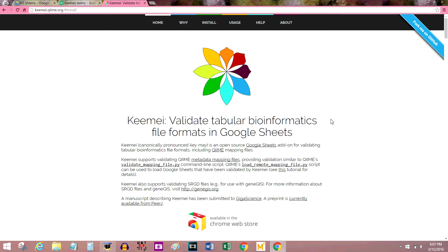Hey there, my name is Riley and today I'm going to show you how to install a piece of software called Keemei. Basically it's a bioinformatics file validation software that's a plug-in for Google Sheets.